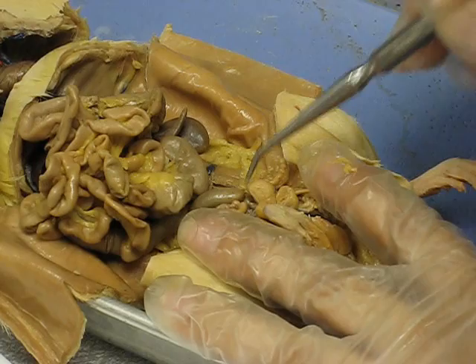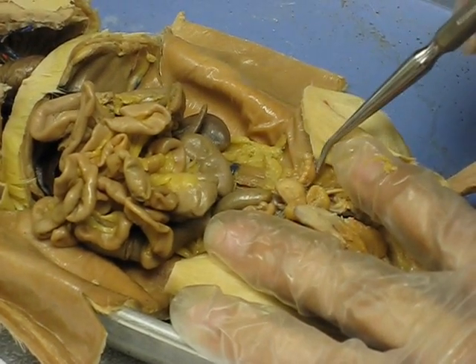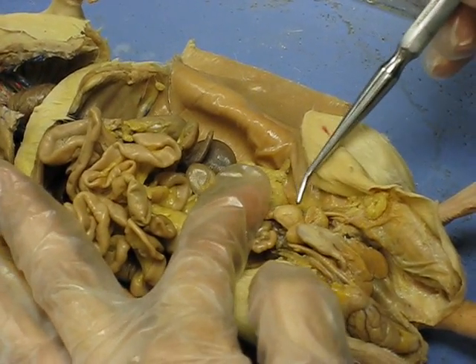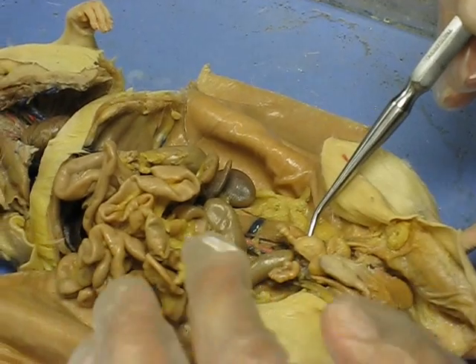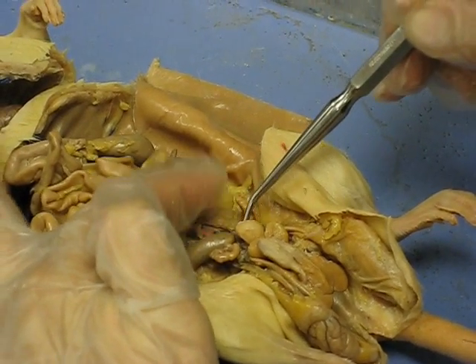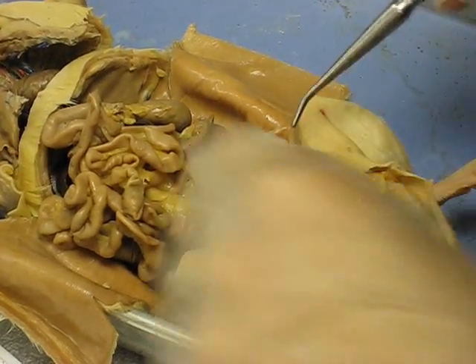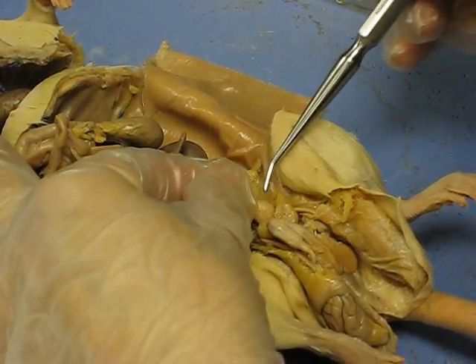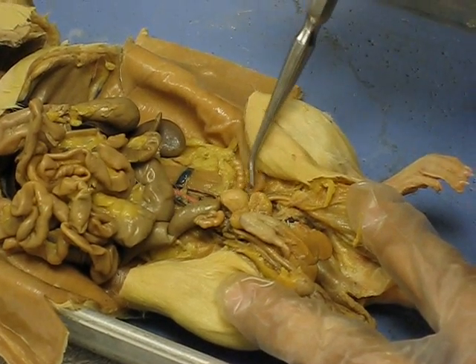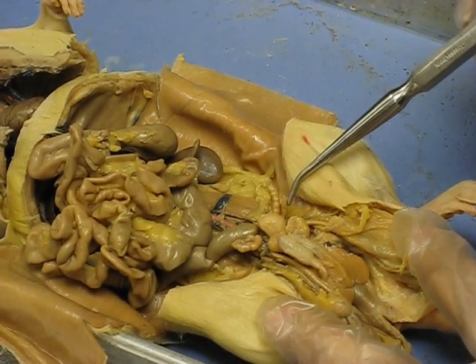These two funky cloud-looking things are the vesicular glands. Embedded within the vesicular gland is the coagulating gland. When you open a male up, the coagulating gland is going to be adhered to the vesicular gland — it's going to look more like that, and you'll have to separate them out. Vesicular gland, coagulating gland — they look quite different from one another. One looks like a cloud, the other not so much.